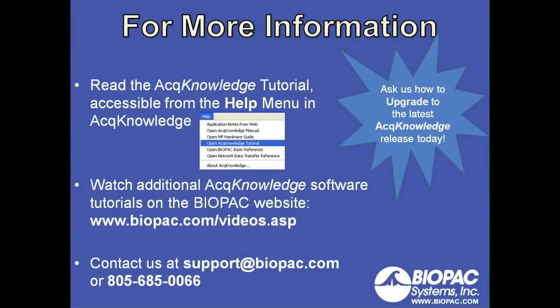For more information on how to set up channels for your experiment, you can read the AcqKnowledge tutorial, which is accessible from the Help menu in AcqKnowledge and also from the Startup Wizard by clicking the Help button.